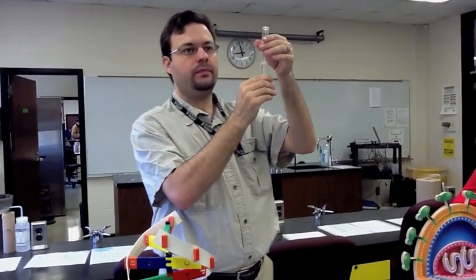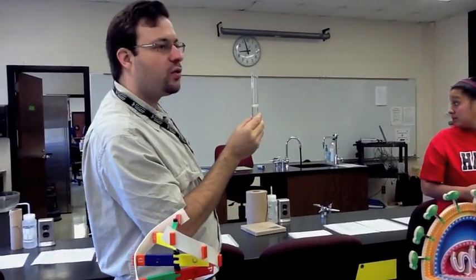Now, what was the last thing we added to the top here? It was inside the green thing on the table up there, in the ice. Isopropyl alcohol, cold 95% isopropyl alcohol.